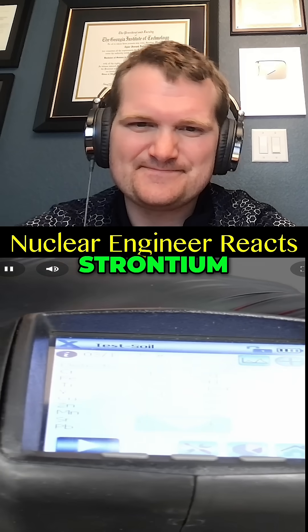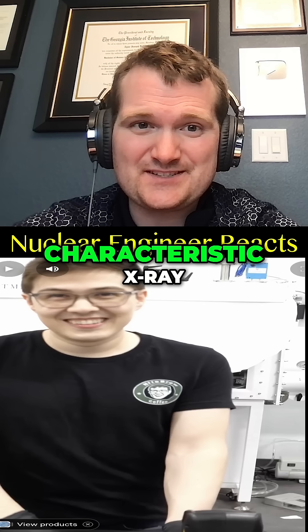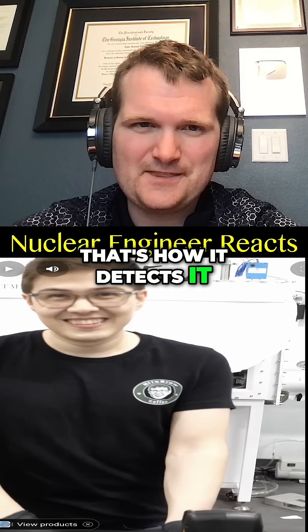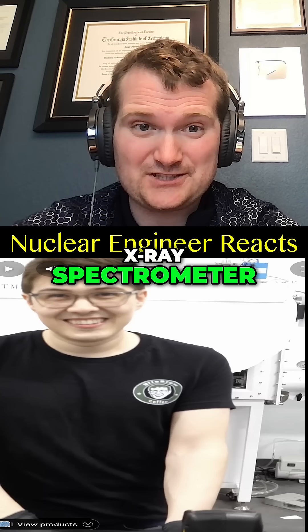It's actually probably the black paint on top — it has iron, titanium, vanadium, copper, zinc, manganese, strontium, lead. That's cool — there's a lot in there. Every element has its characteristic x-ray, and that's how it detects them. Think of it as a portable, low-power x-ray spectrometer.